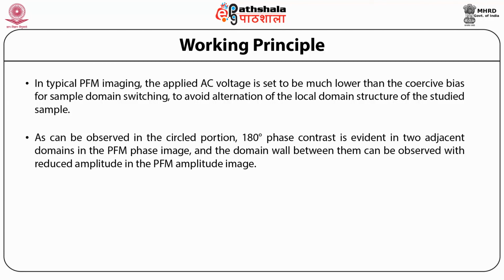Also, the upward and downward oriented domains have induced a PFM amplitude of similar magnitude, indicating the material property is relatively homogeneous in the studied sample.